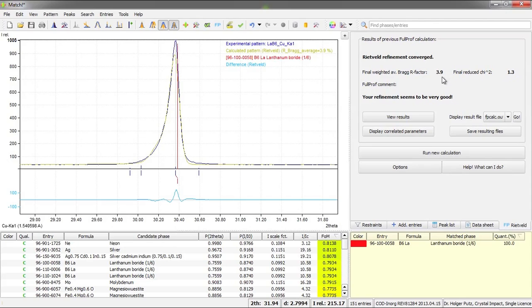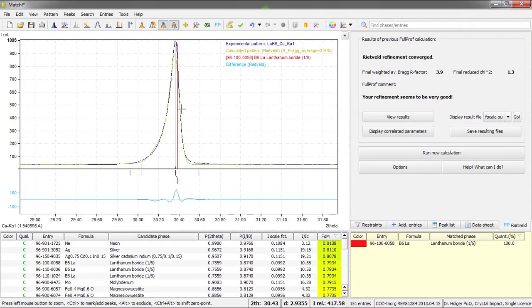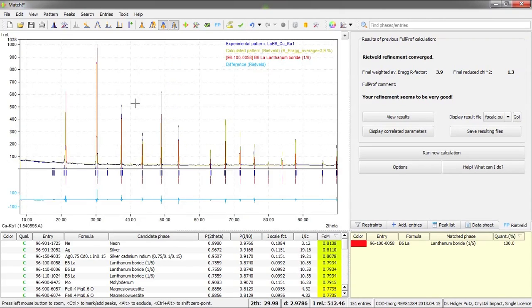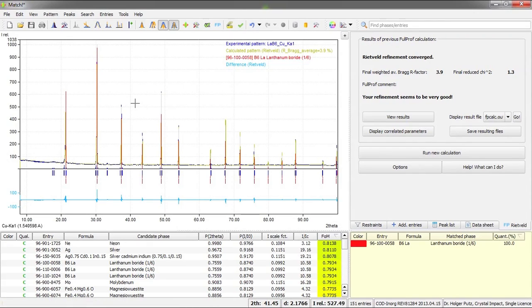The agreement factors have reduced and also you can see in the diffraction pattern that the agreement between the calculated and the experimental peak is now much better. So let's return to the full diffraction pattern.